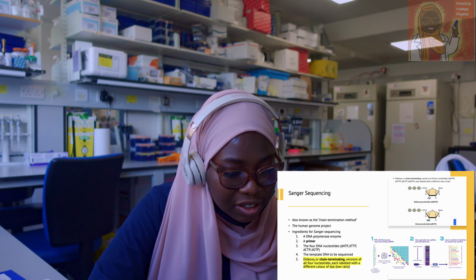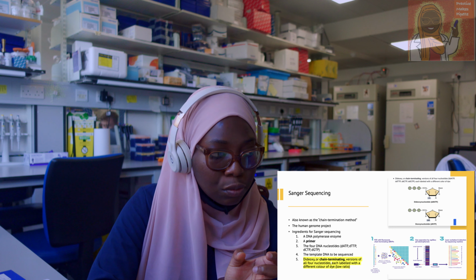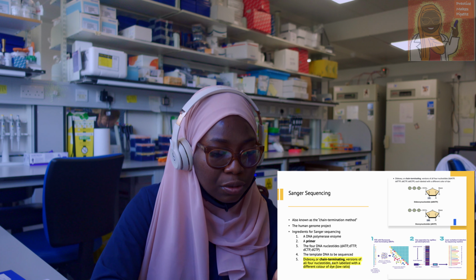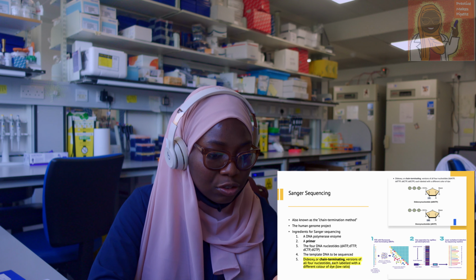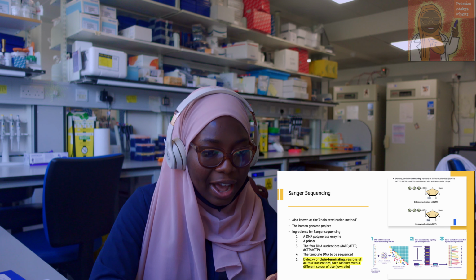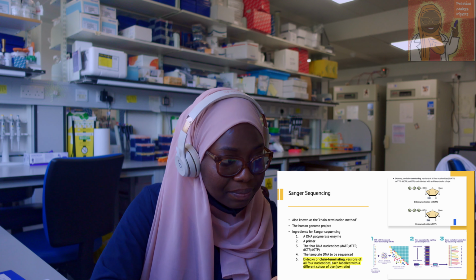And after this whole process, we're going to have different fragments of DNA. So we're going to run these fragments through capillary gel electrophoresis, and automatically the short fragments move quickly through the pores of the gel, whereas the long fragments will move slowly. So as each fragment crosses the line, the dye is detected, and once the dye is detected, it is displayed in a chromatogram as you've seen here.